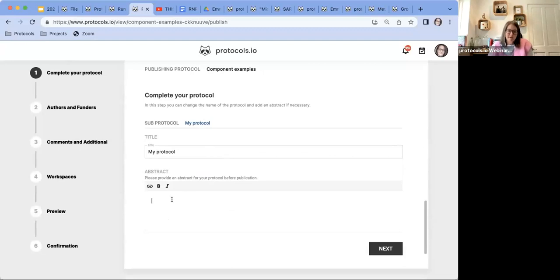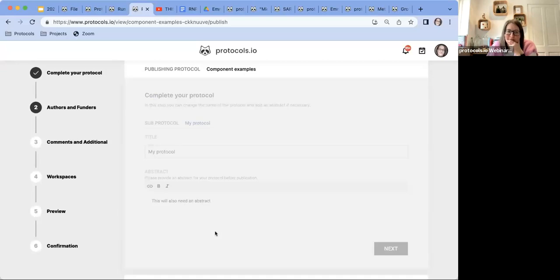I don't know if that's working. It's very slow. Catching up with my typing. So you have to put those things in. You have to complete those steps before it will let you go ahead. But yes, we seem to have gone very slow.